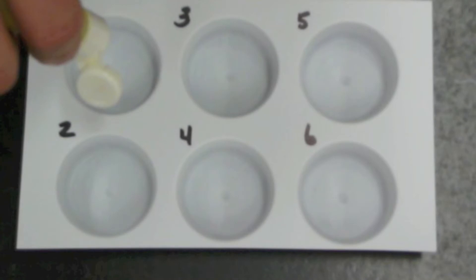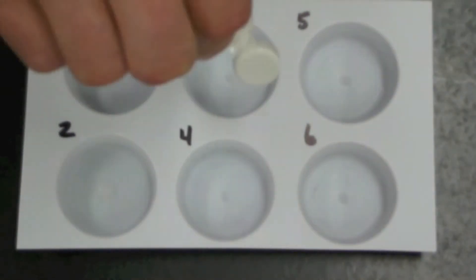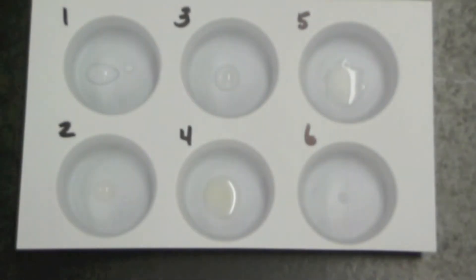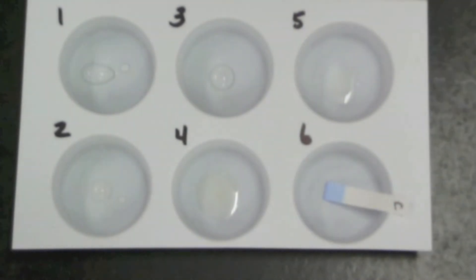First we'll add all of our liquids to each section. The strip that I just put in section six is called a control. We'll look back at this strip to see if anything has changed after we add our liquids to each of the strips.